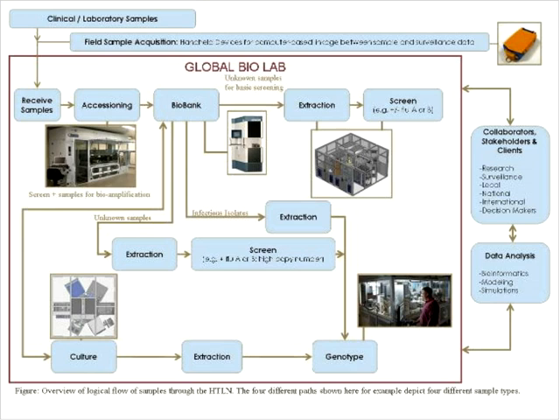Conceptually, the Global Biolab is a facility, a biocontainment facility, that contains these automated systems. So unique in the sense that it allows for handling of up to biosafety level 3 pathogens and select agents. So it's engineered to be able to handle those. And that the systems are connected to each other through not just a laboratory information management system, but also a more extensive IT system, which I'll describe to you, that allows for field data that's acquired on handheld devices and the epidemiological data collected in the field to be integrated in with the data that's collected on the individual automated systems and collected through the LIMS system, and then able to be visualized by the collaborators and researchers who are making use of the facility.